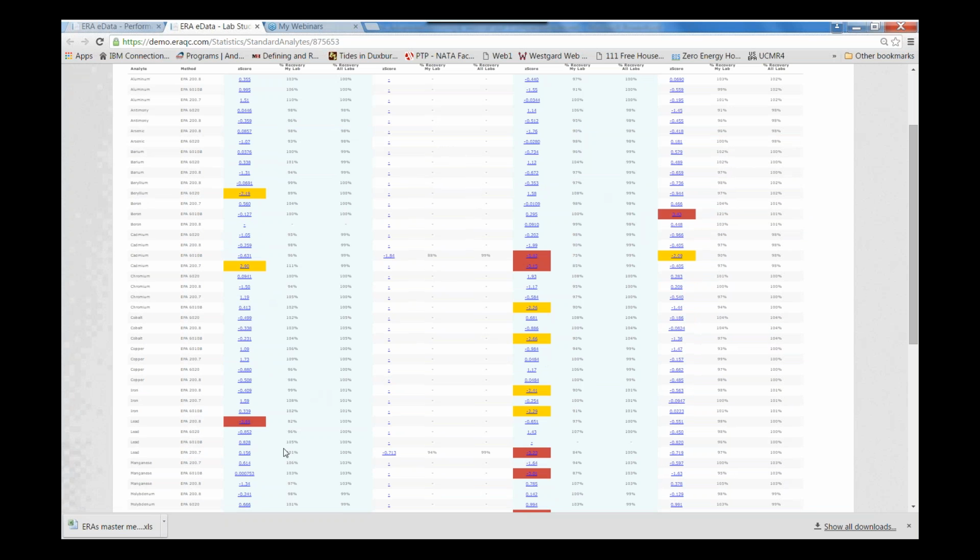And let's take a look for lead. So obviously here's the one that we had a problem with. We can take a look at our recovery. So our recovery on this one was 82%. But on the last two studies before that, for this particular method, we performed pretty good. We had a recovery of 97%, 98%, and that corresponded to Z-scores that were pretty close to the mean.